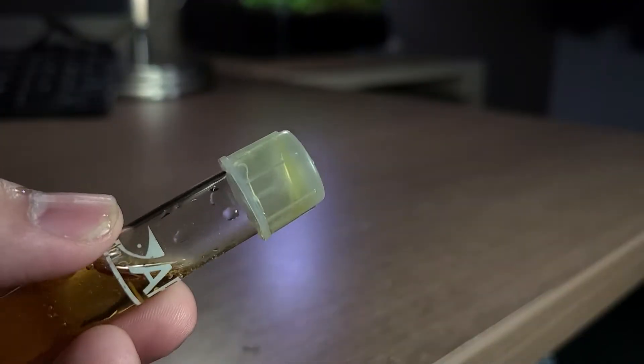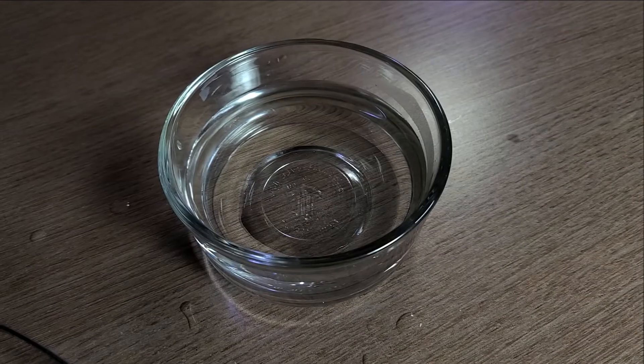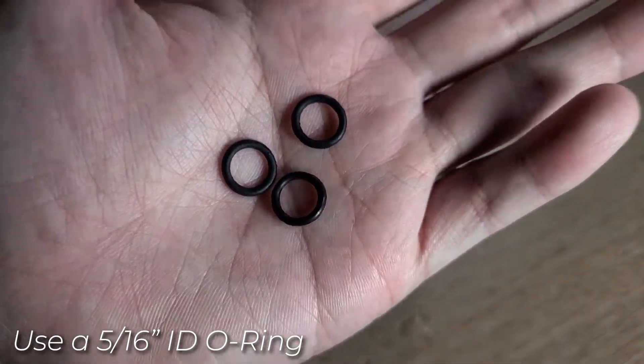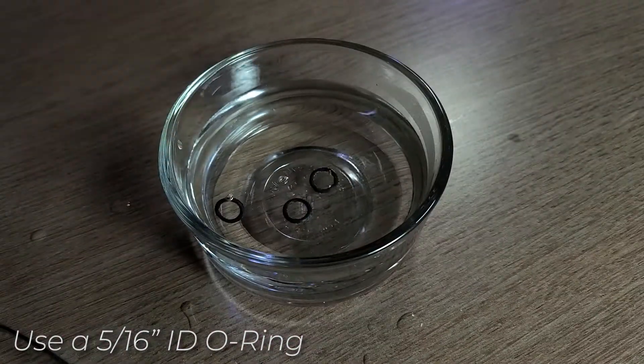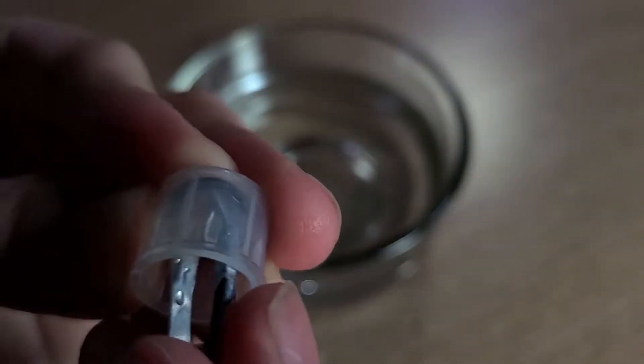But oh no, the test tube is leaking. What can I do? Here's a quick tip. You can heat up an O-ring with a 5/16th inner diameter in hot water, and then add it to the cap as shown.